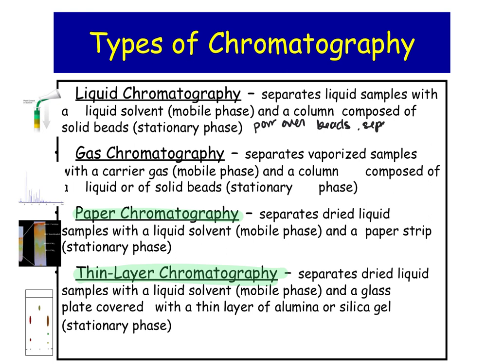and they separate by size. So the bigger ones sink to the bottom. Gas chromatography is similar. The only difference is you're vaporizing those samples. So this is really useful in quantifying and also for identifying.